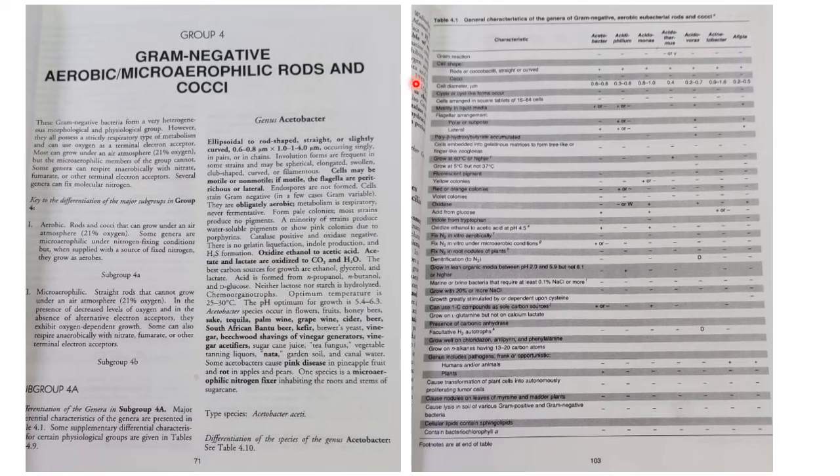Let's assume that my culture is Acetobacter. So I will start performing the biochemicals and then compare my results. You can see the given genera here: first is Acetobacter, then Acidiphilium, then Acidomonas, then Acidothermus, then Acidovorax, and further on Acinetobacter, etc.